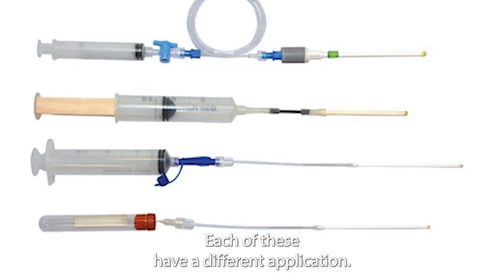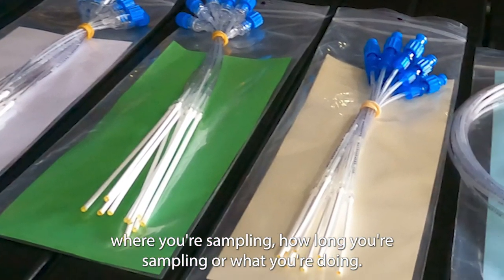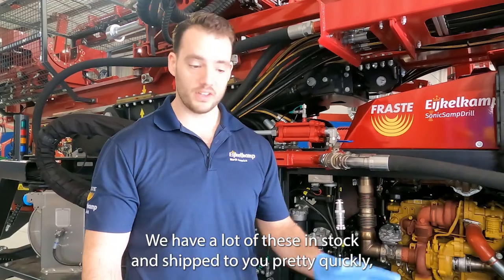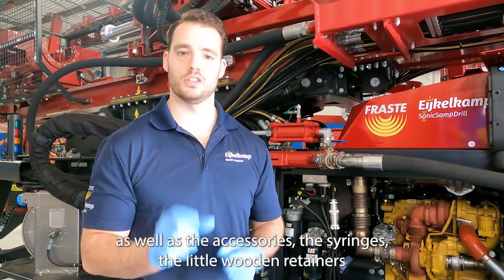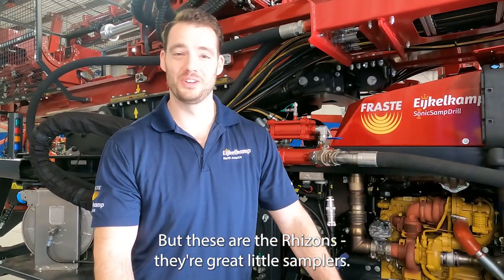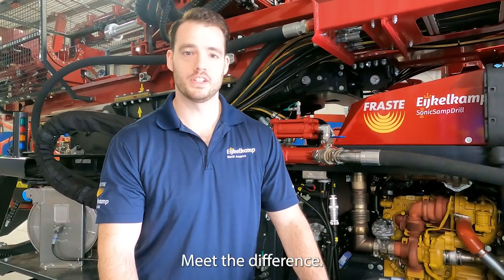Each of these has a different application depending on what you're trying to sample, where you're sampling, and how long you're sampling. We'd love to help you select the right one. We have a lot of these in stock and can ship quickly, along with accessories like syringes and the little wooden retainers that hold the syringe open so you don't have to have grad students stand there — flashbacks to grad school. These are the rhizons — great little samplers when you're looking at pore space water. This is Alex with Eijkelkamp. Meet the difference.